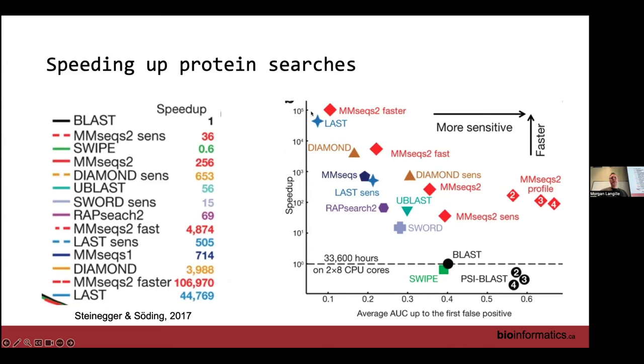It's not bad. Most of them will do a pretty good job, and then maybe you can extract your tables and manipulate them after. I guess for myself, I just like the customizability and knowing exactly what's going on behind the scenes. But there's inherently nothing wrong with them. It's just that you're a bit locked into what they're doing.